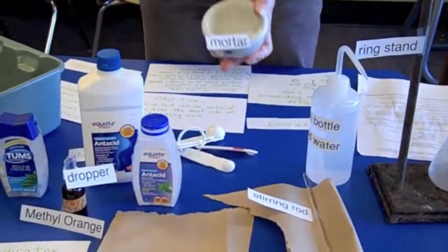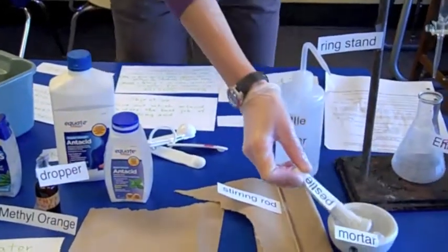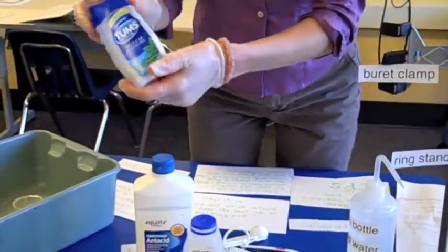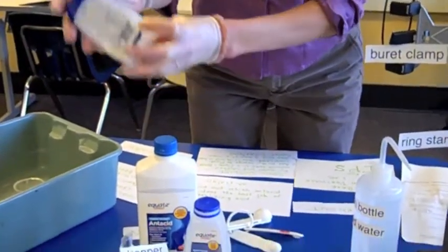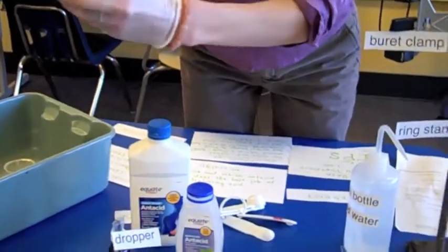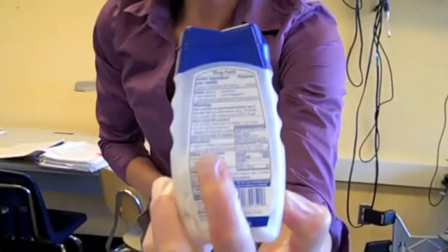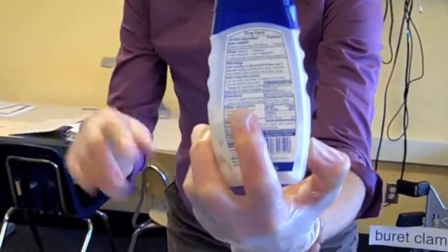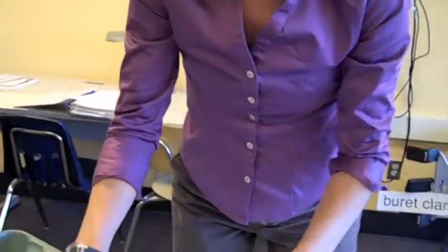The dosage says 2. Good question. We're going to use half a dose because then we don't waste so much of the school's money on supplies. This dose is recommended to be 2 to 4 tablets. So we're going to take the lower of those two numbers, 2, and we're cutting it in half. 1 tablet of Tums, 1 tablet of this generic Equate antacid.